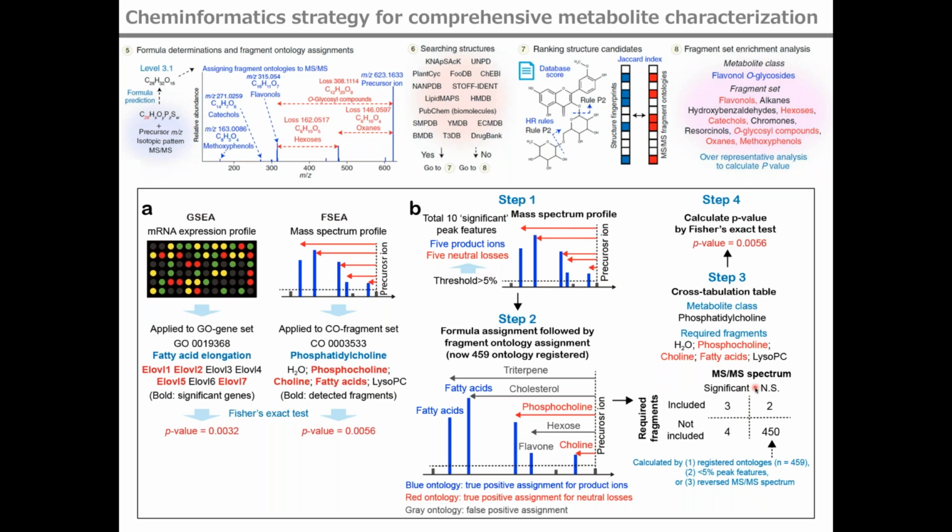I think one of the drawbacks of this methodology is that there is no objective way to define what the significant peaks are. Therefore, I created several methods to define peak significance, but I will perform further investigation to recommend metabolite classes more effectively.